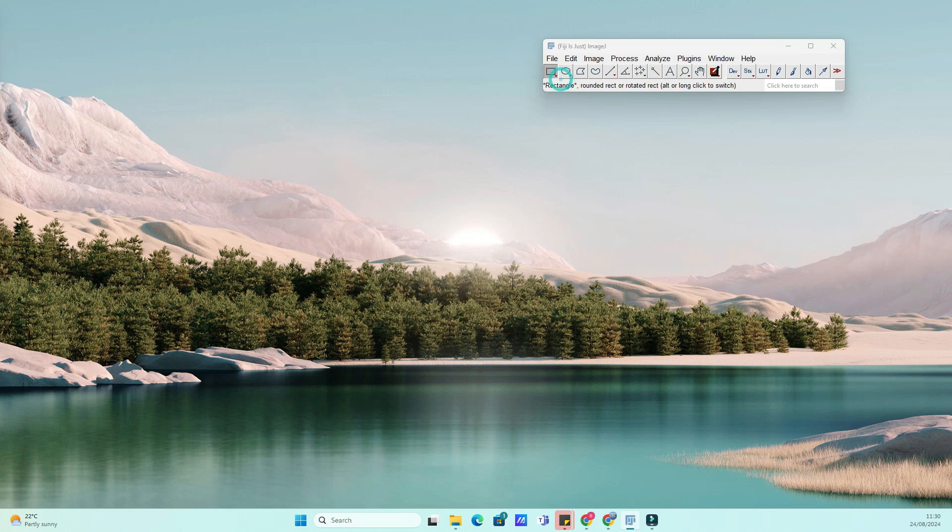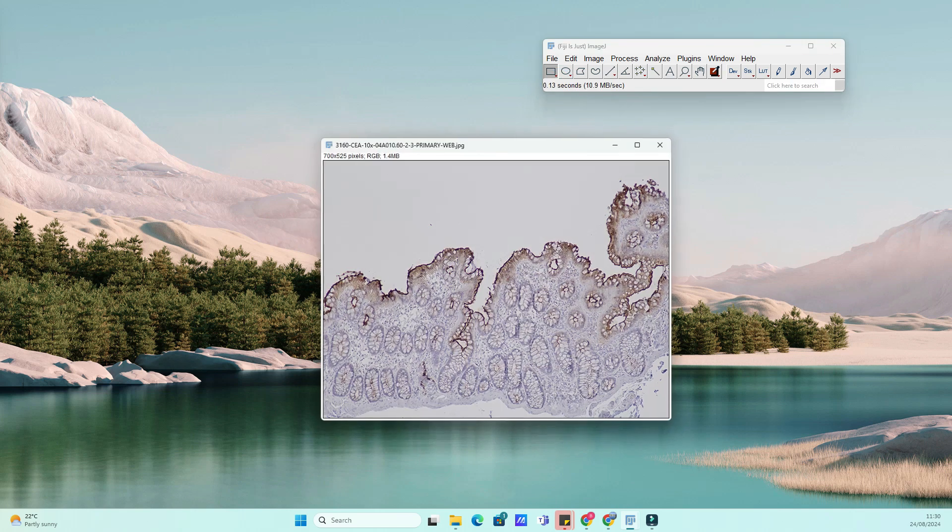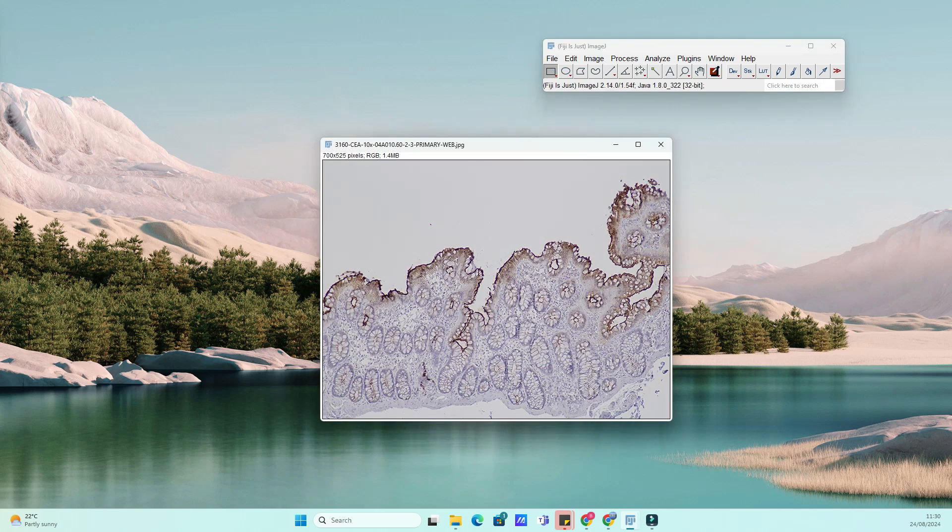This is a crucial step for those working with microscopy images, as it helps in accurately representing the scale of your images. Let's jump right in.